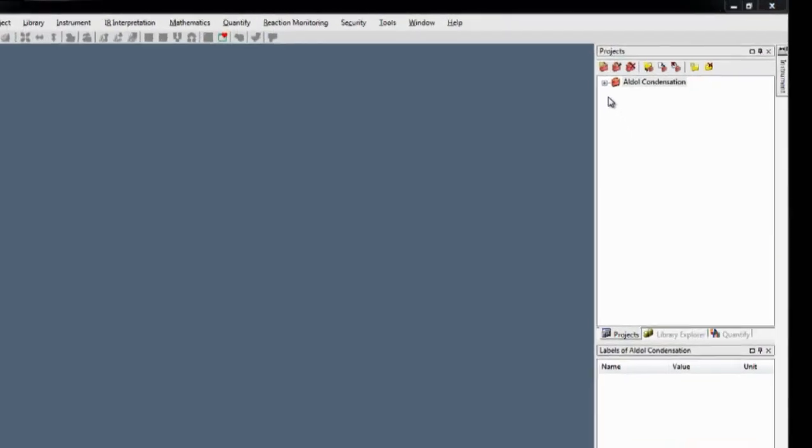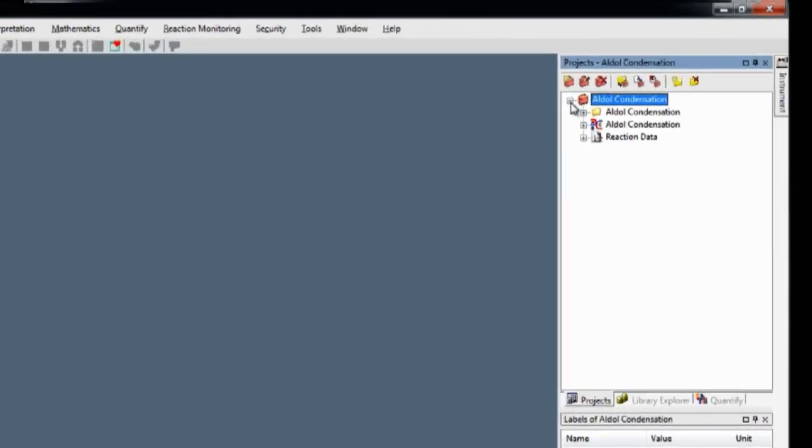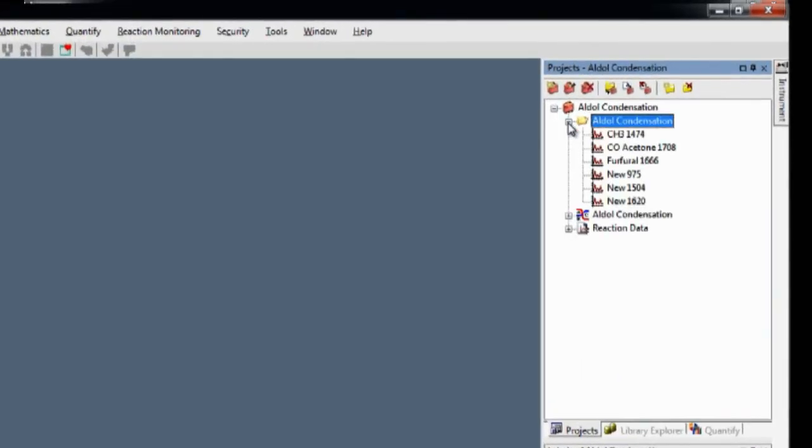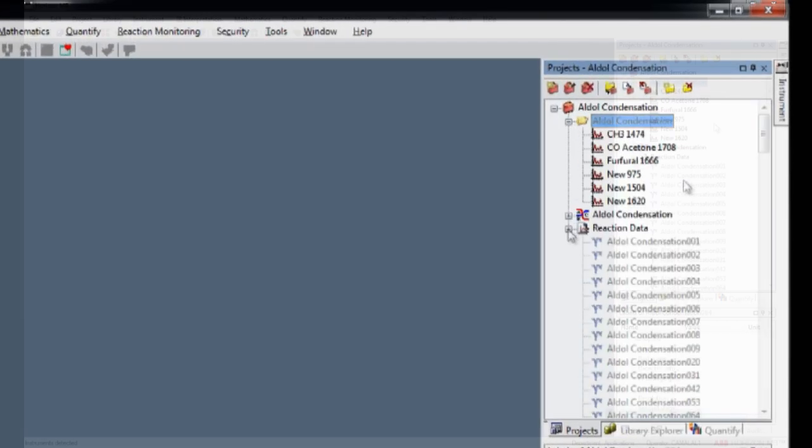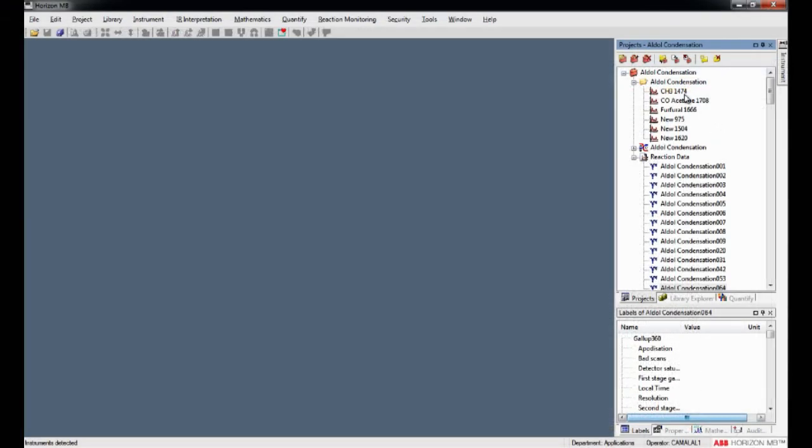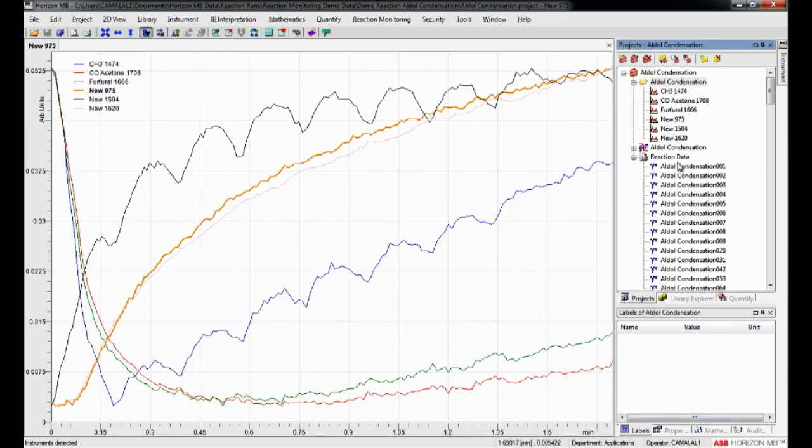All trends, spectra, and reaction configuration associated with the specific reaction can be organized as a project and archived or exported.